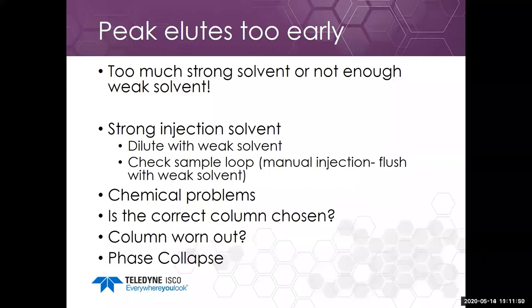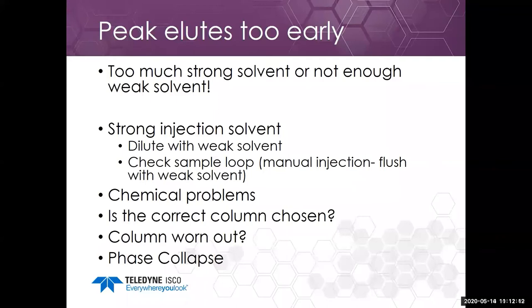Another issue is whether the correct column was chosen. There was one time I ran something and the compound eluted very early — it turned out someone had replaced my C18 column with a silica column on a prep-LC system. While it's okay to run acetonitrile and water on a silica column for very polar compounds, it doesn't work well when trying to run it as C18. Also, columns can get worn out; prep columns take more of a beating than analytical columns, used with buffers and modifiers.